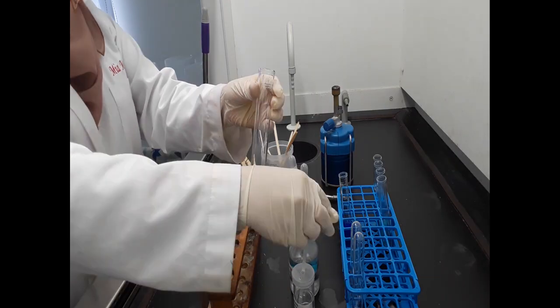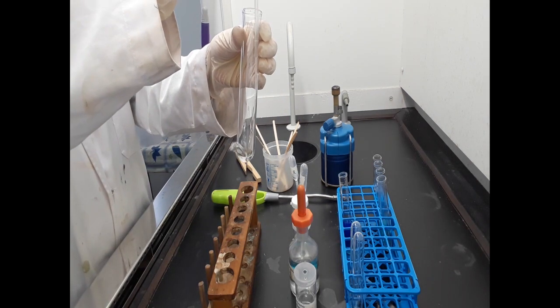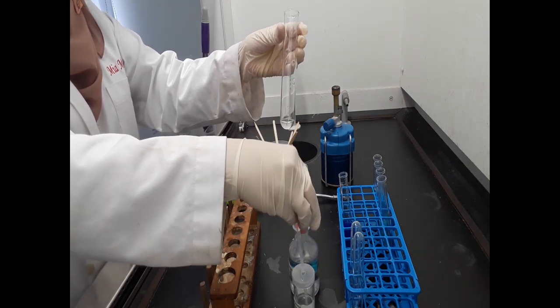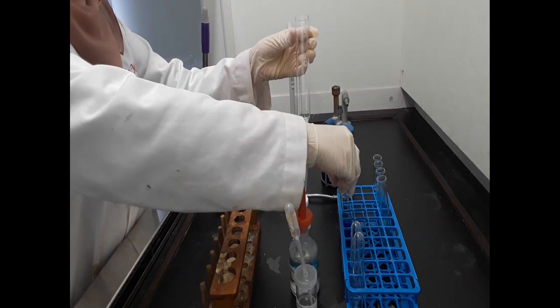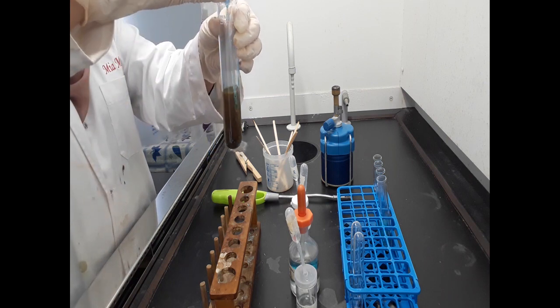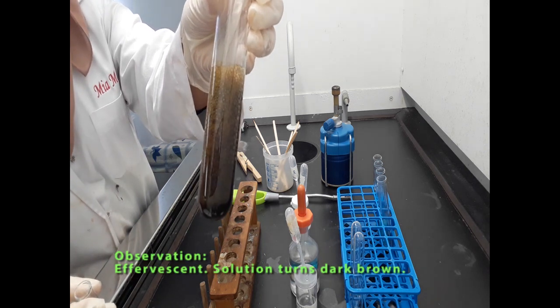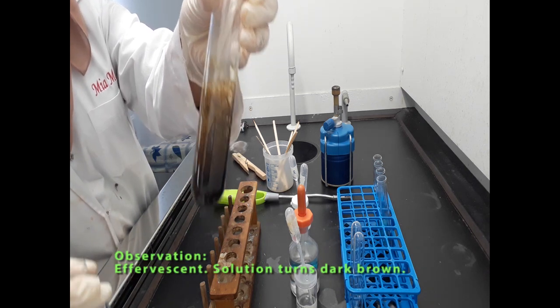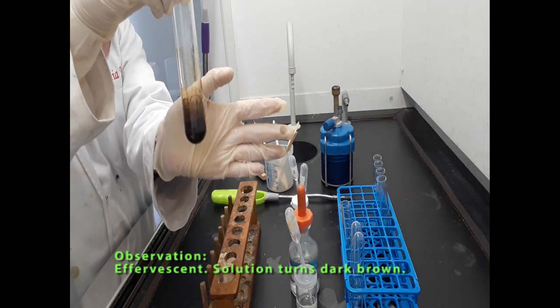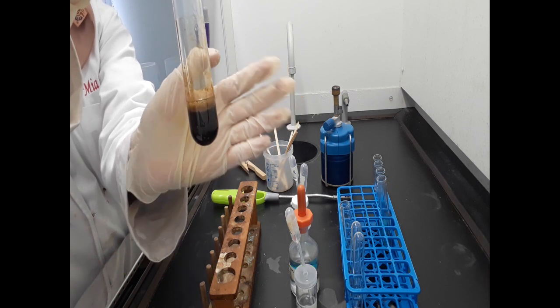Next, question 2C for solution S. In a boiling tube, add 1 centimeter of hydrogen peroxide and then add the final mixture from B. Immediately after adding the mixture from B, the solution turns darker and effervescence is observed in the reaction test tube.